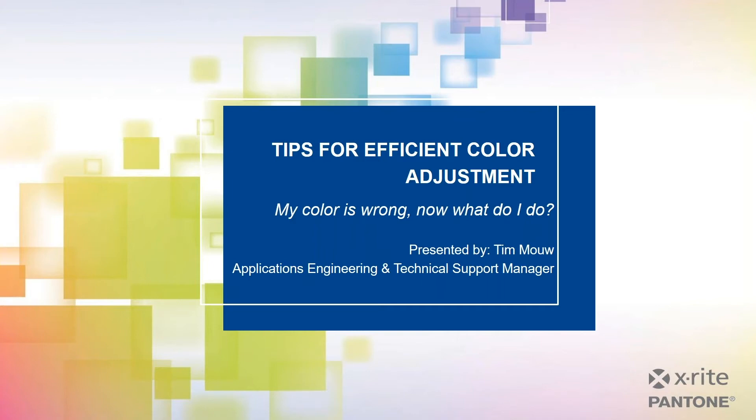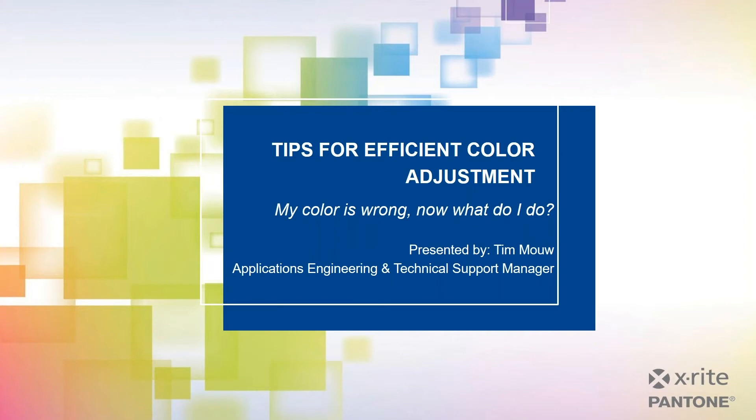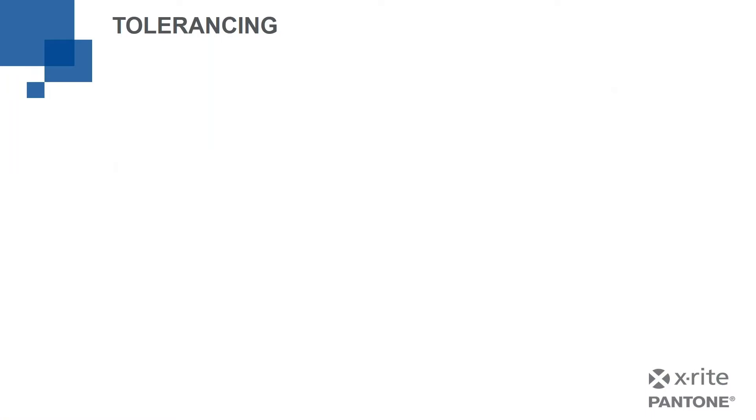Thank you, Robert, and welcome, everyone. You may see the title of my slide here is slightly different than what Robert said, but I titled it Tips for Efficient Color Adjustment. It's been called Tips for Efficient Color Matching. We've used a number of different names, but the reality is really that question in the middle: My color is wrong, now what do I do? In this series, this is webinar number five of a QC series. We've talked about establishing standards and knowing whether my color is good or not good, but we want to talk today about what do I do when it isn't good? Because just telling you color is bad isn't enough.